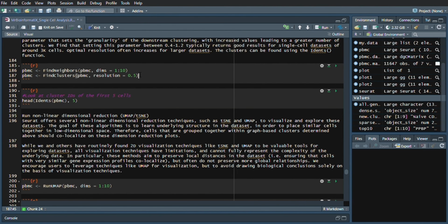The shared nearest neighbor graph is to make the connections more accurate. The algorithm looks at how many neighbors each cell shares with others. If two cells share a lot of the same neighbors, they are connected more strongly. And for the overlap of local neighborhoods, this means adjusting the connection between cells to reflect how similar the groups of their neighborhoods are. So let's run our code.